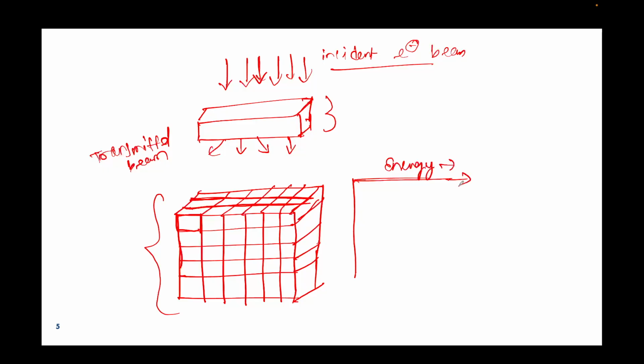Let's say this is x, and this is y. If this is the direction, then just where the incident electron beam touches the sample, the energy amount will be extremely high. And once it interacts with these different types of atoms, meaning different boxes, its electron energy will subsequently go down, like this. So this is an example of energy I have given.